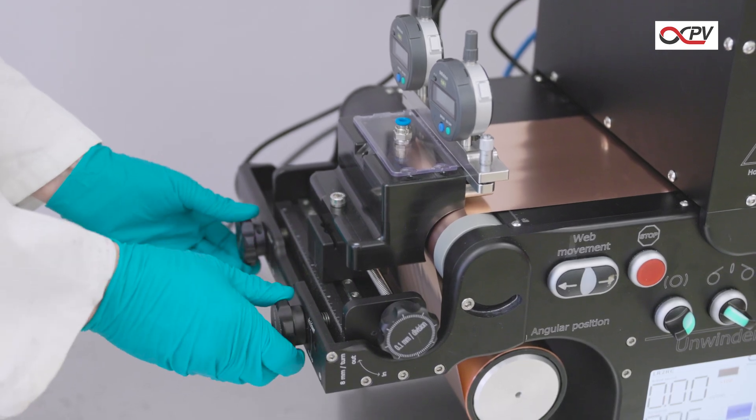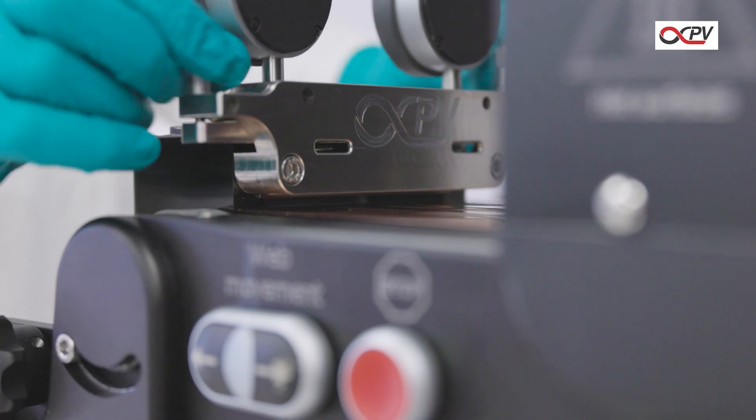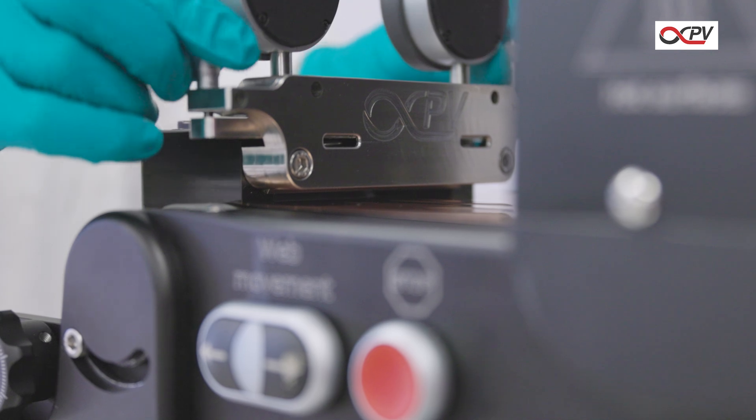Engage the ink reservoir against the roller for a tight seal and adjust the gap with micro precision between the coating knife and substrate to your desired wet film thickness.